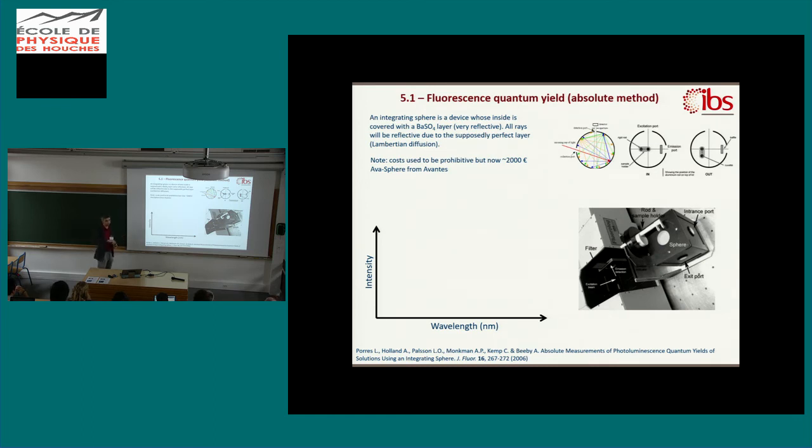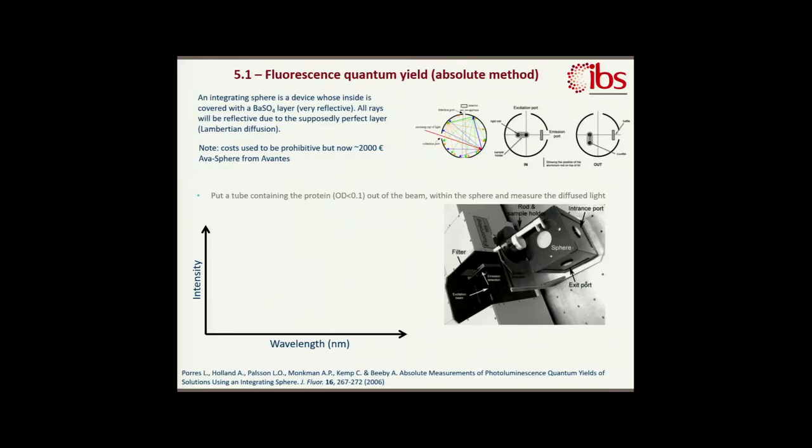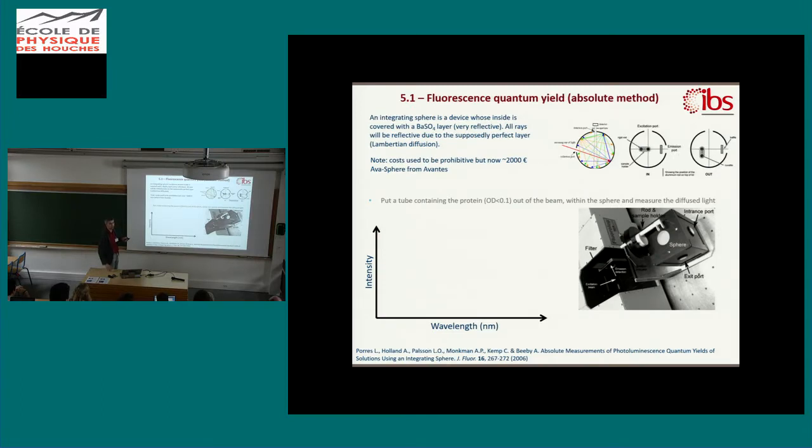So if you put the tube out of the beam, you'll have only the direct excitation. You put a tube of OD below 0.1. Very often students use a much higher concentration, almost 1 OD. For fluorescence, take care of the inner filter effect. You'll have biased results, otherwise it means that your proteins beside can reabsorb the fluorescence.